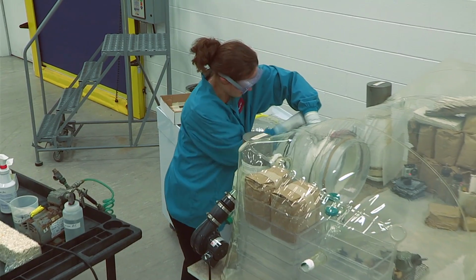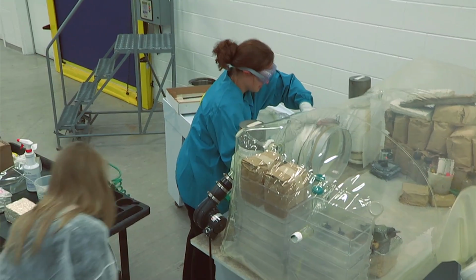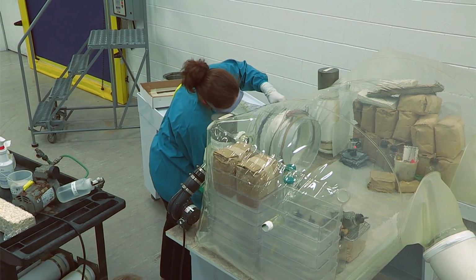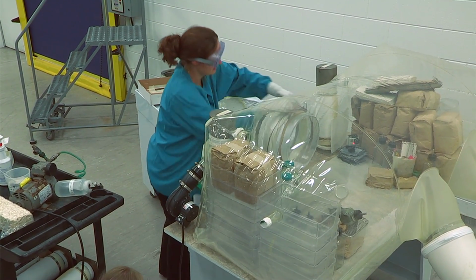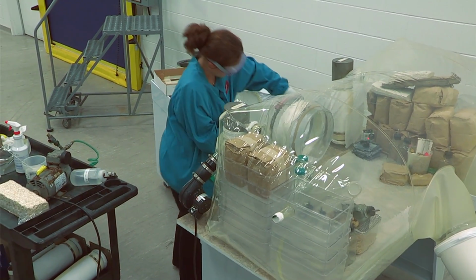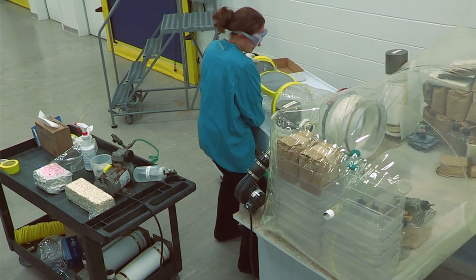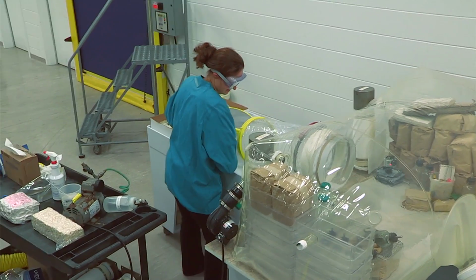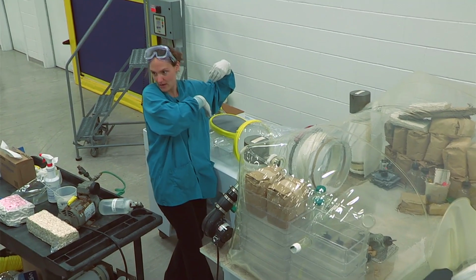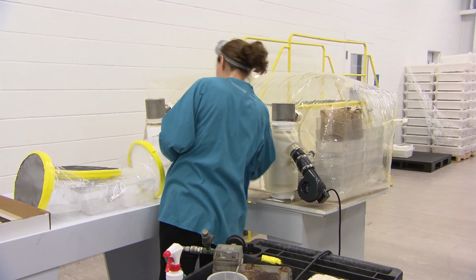Try to slide your band up without losing your sleeve. Okay, we got it. Oftentimes, if you get a little bit too much pressure, the sleeve will just fly right off, and it is hard to get this in here.